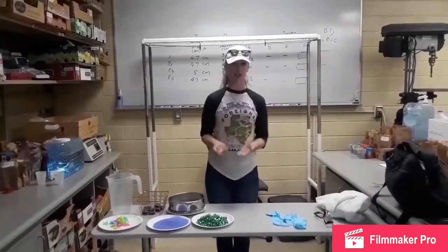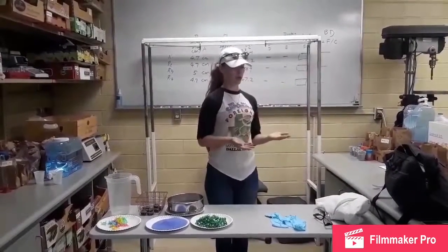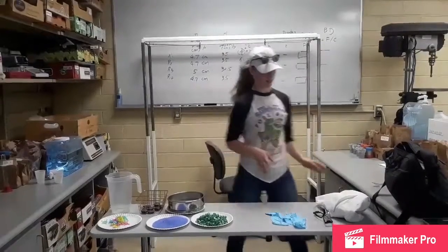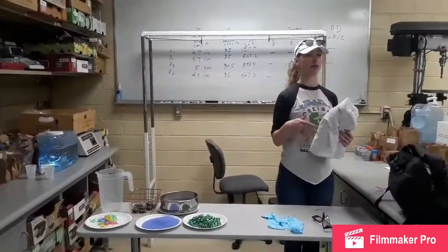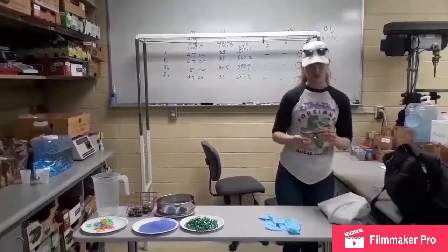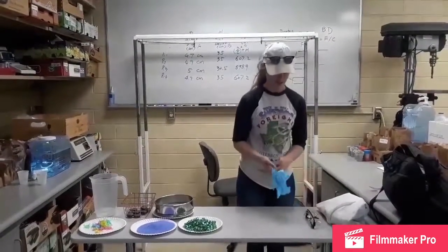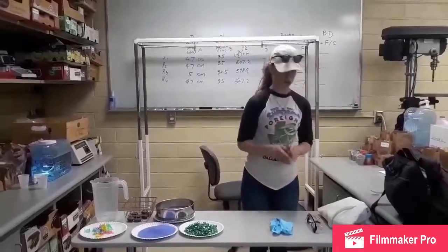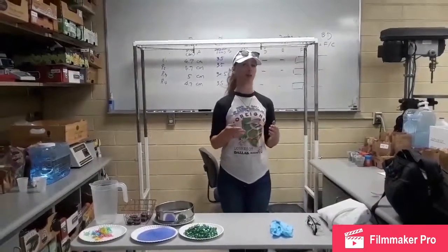Before we can start, we must talk about safety precautions. First, you must have your lab coat to ensure that you don't get any chemicals on your skin or clothes. Next are your safety goggles to protect your eyes, and then your safety gloves. Also make sure to never wear any revealing clothes or open-toed shoes so you can't spill any chemicals while doing an experiment.